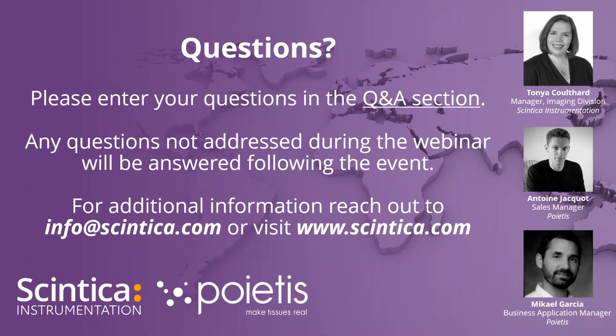And if you want to distribute cell droplets onto an existing object, then of course you would need to rely on viewprint, the function that we've demonstrated. And here there's no way to automatize this because you need to select the spots where you want cells to be distributed. So the computer or the instrument does not know in advance the exact spots that are of interest for you. So no, there's no other way to do it but the main way we showed.